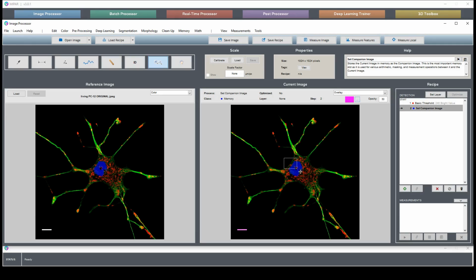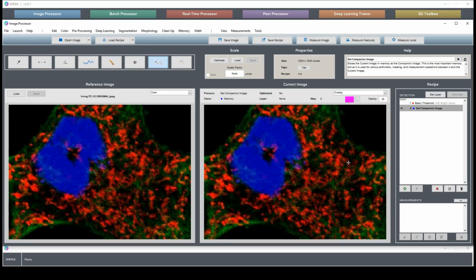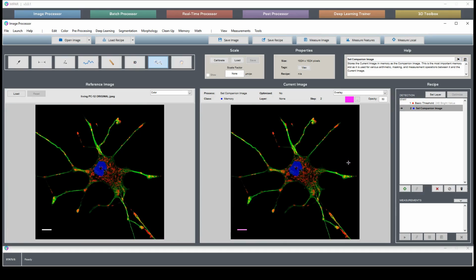Because we're going to be measuring the mitochondria, and theoretically, based on the experimental manipulations that we use, these mitochondria might be present in different parts of the cell. Perhaps there's some sort of mutation which causes all the mitochondria to ship out to the neurites.